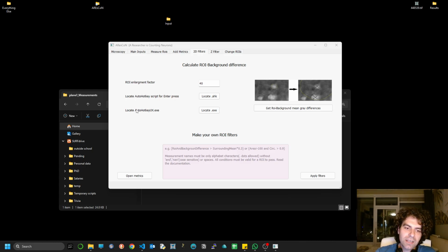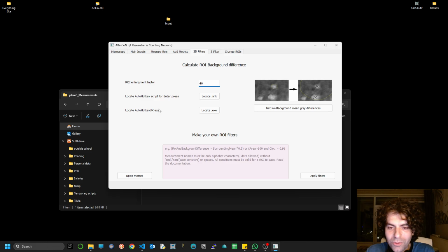But you need this kind of program. You need to install this program on your PC. Why? I will also explain. And again, it might take a bit of time. I understand you might want a faster tutorial, but I think it's good to have everything included in this one, and then of course you can filter out the information that's not that valuable to you.